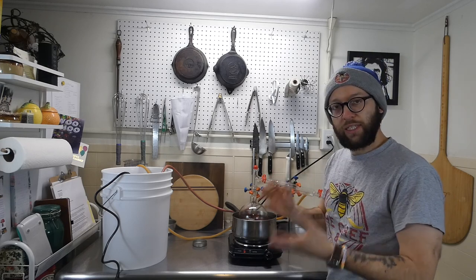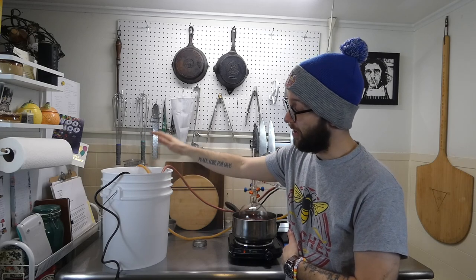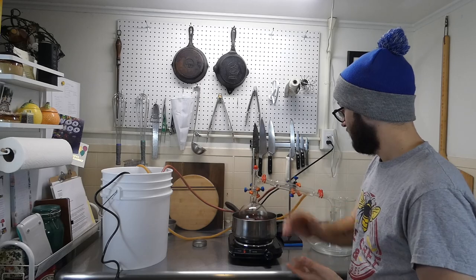Once again, make sure you have your bucket of cold water, put your ice in there, and we'll plug it in and get started.